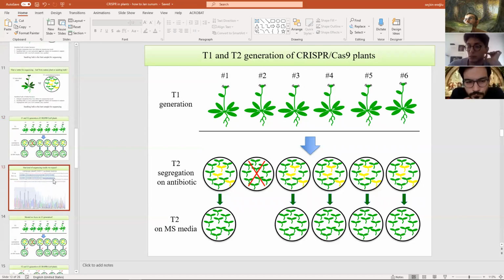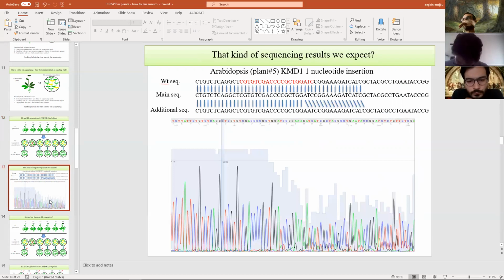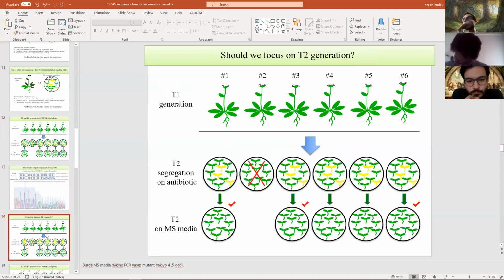And here you can see there is no yellow plant, which means the T1 plants didn't take the vector. So Sezgin, you may end up with these plants, but we already have the vector, we know. So we have the T2 seeds, we will sow them and we will take the green seeds to MS media, otherwise they will die, okay? Then we can do the PCR thing, but I'll first tell this thing.